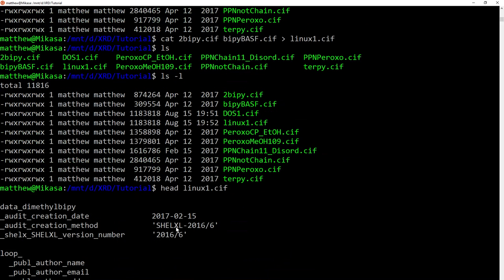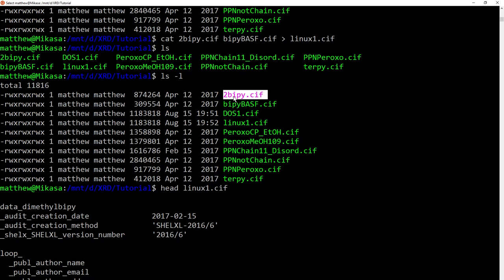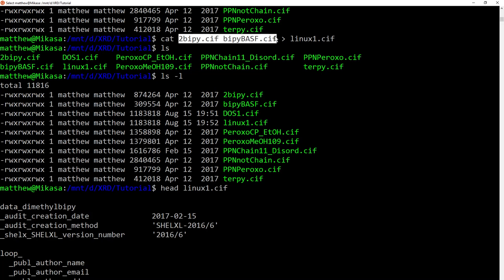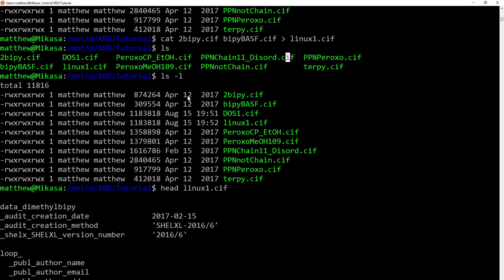And you can see these two are the exact same number of bytes. They're exactly the same. And you can see if I type in the head, that starts with the authorship block of 2bipi.sif. They will go in both of these cases, they go in in the order you list them. First file, second file, and so on. Which is how, if you want to have a separate authorship file, just list it first in the command, and it will wind up at the top.